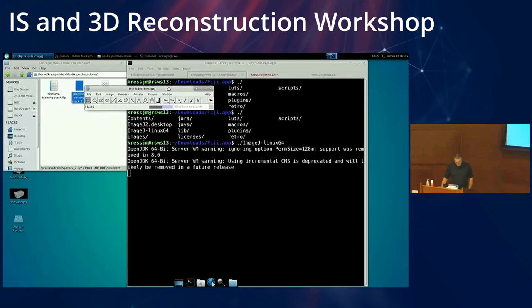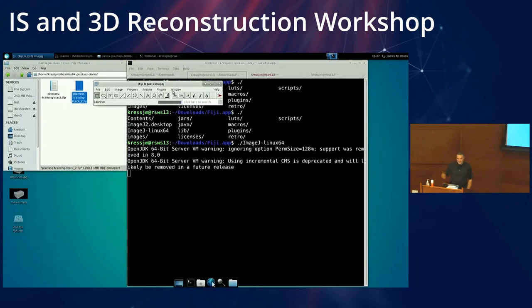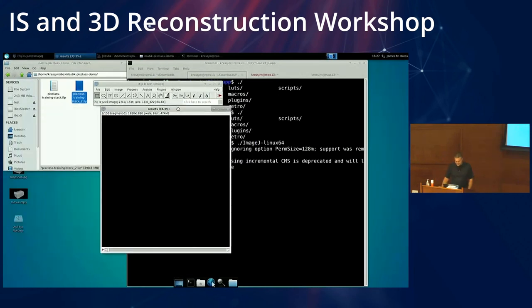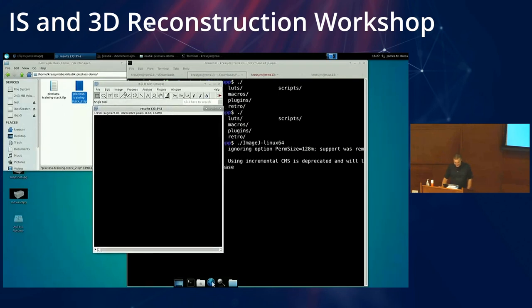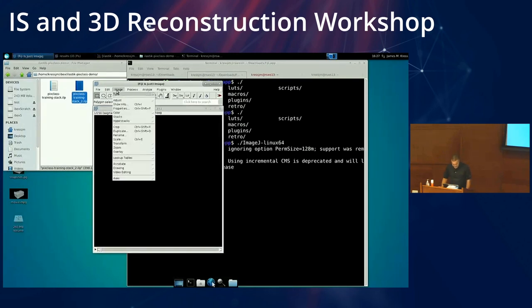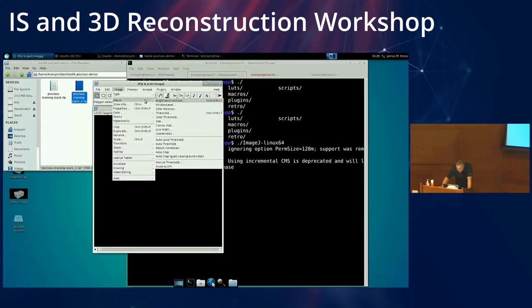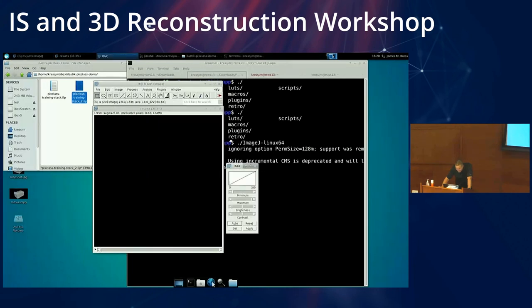And you'll initially notice that we'll see nothing, because as with Avizo, it's interpreting these as a whole grayscale image with values ranging from 0 to 255 or whatever, so we're not going to see anything yet. So in order to see something, we need to actually constrain the range of our pixels. So we can go to, if I can remember where to do this, Image, there you go, Adjust, Brightness and Contrast, thank you.